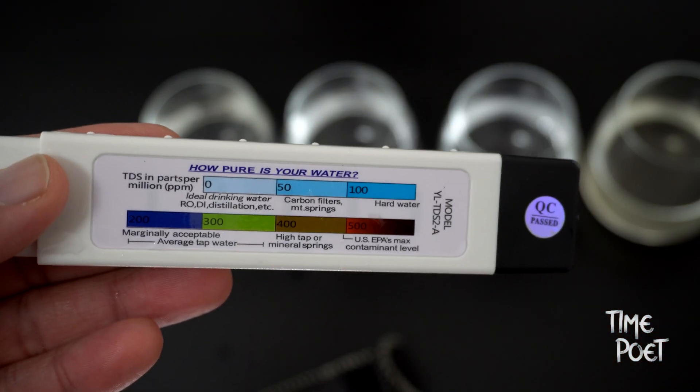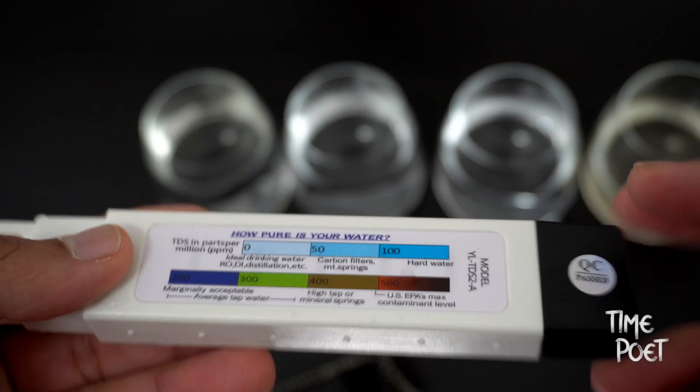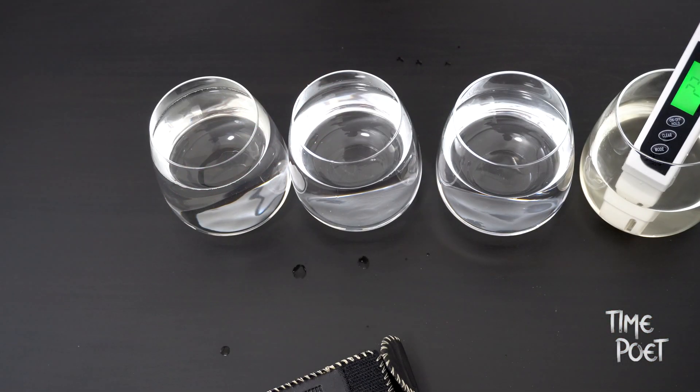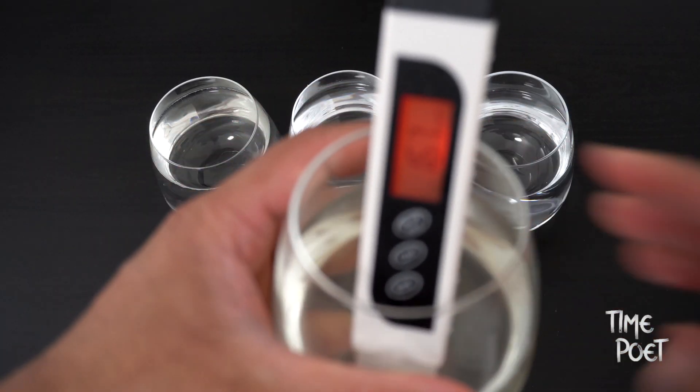Now finally, let's have a look at some slightly contaminated water, which has obviously got dissolved solids from the color. As you can see, the value we've got here is 167, which is more on the higher side.